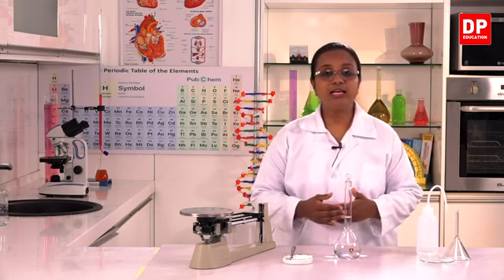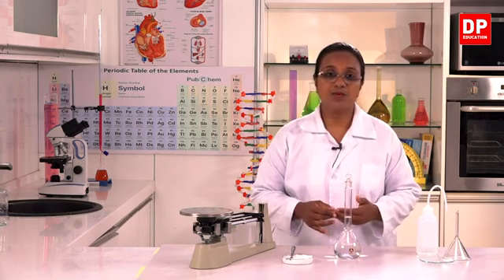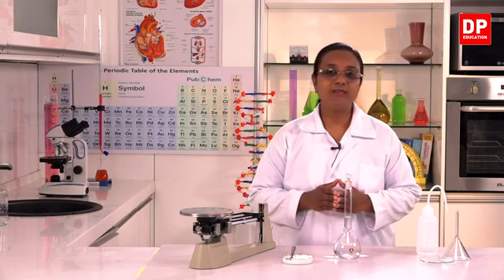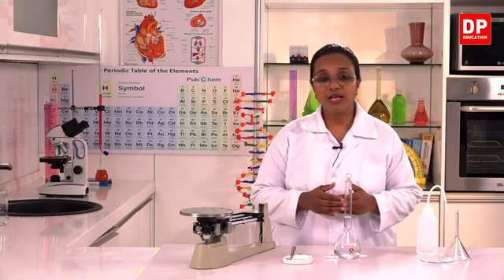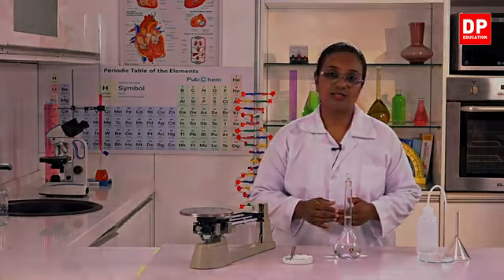And to make it more clear, if there are many people working in the lab, we can also include the name of the person who prepared the solution. So then the label will have all the necessary information. So students, keep it in mind that when we prepare a standard solution, the measurements have to be accurate, all the glasswares have to be clean, and once we do the preparation, we have to label the solution. So here I have the standard solution of sodium chloride. I have to have a label on this.